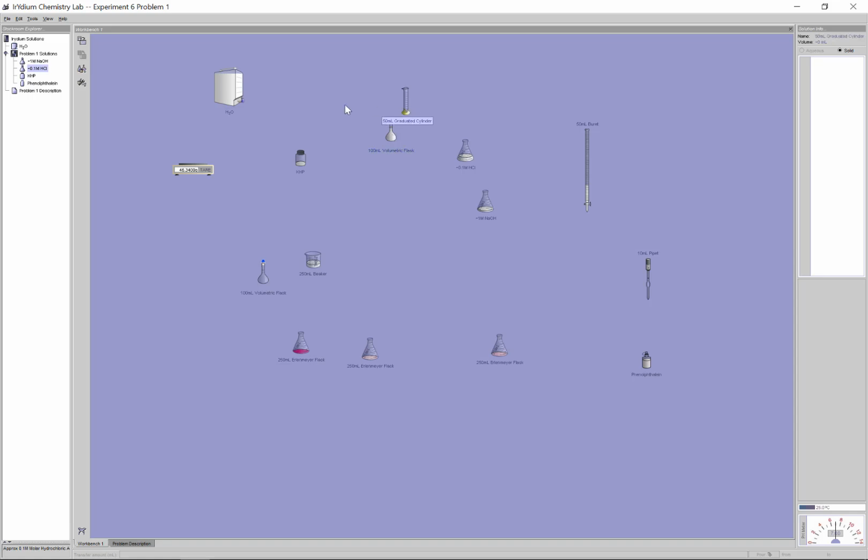And what we're going to do in part 2 here, just let me pull some of this glassware aside, we're going to titrate this diluted NaOH. I already found the concentration earlier, we're going to titrate it against an HCl solution. Okay. The technique here is very, very similar here. What we're going to do, I'm going to still keep the base in the burette. So I'm going to pull out a new burette here. Again, usually I just tell people, fill it up something more than half, right? I don't want to run out of solution sort of mid-titration. Every time you have to reload, you're actually introducing some error.